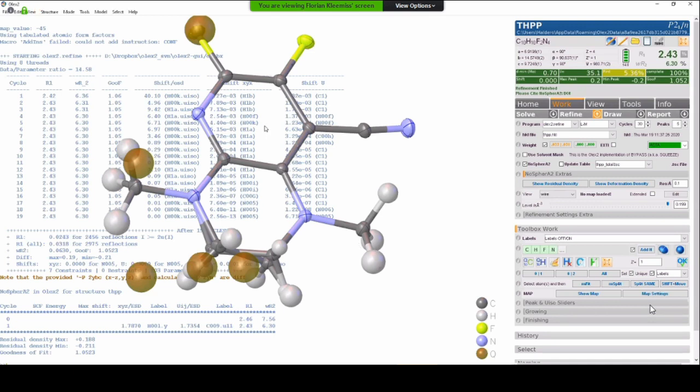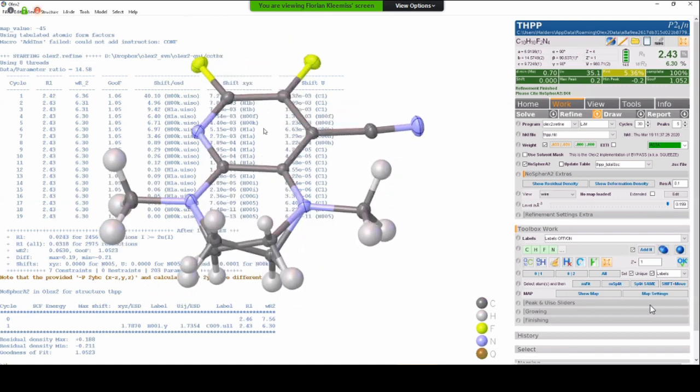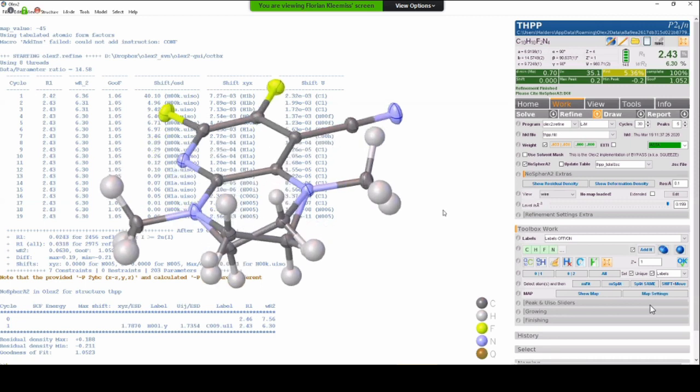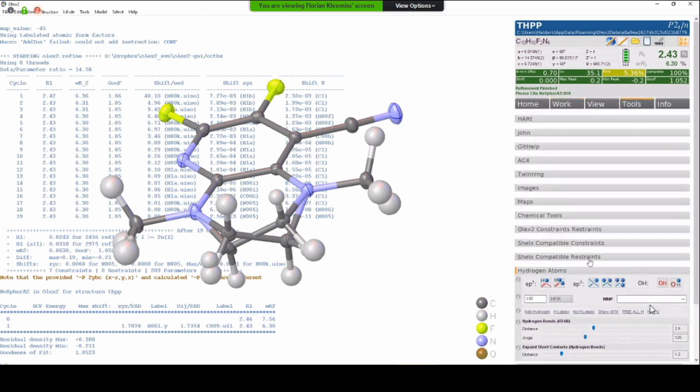It's nothing to do with this actually, but I noticed Florian go into a very nice tool where he could add the hydrogens, and effectively you could visually put in the different HFIX commands for CH2, etc. I missed what he did because that's something I need to know at a very basic level. How to add the... it's on Tools. I see. Tools? Yeah, Hydrogen Atoms, and then you can select if you want to have sp3 or sp2, so the CH sp3 hybridized or CH sp2 hybridized. OH is there, or you can use whatever HFIX you want. Okay, that's brilliant. Thank you.